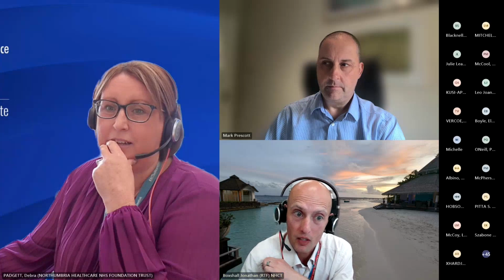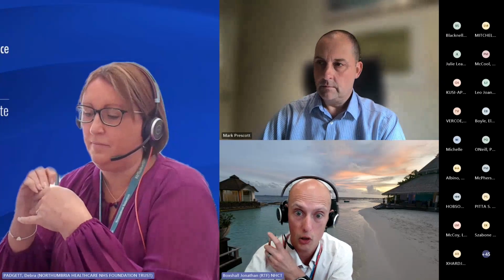So for me, we kept it quite generic for now, and then we will get to a point where once there's a period of stability, soon may that come, then we can possibly look at updating that generic competency. But that's how I would approach it, and even as a UKAS assessor, I'd have to be fairly understanding that you're in a period of flux. So long as there's something to demonstrate competence with the system as is, I would be happy.